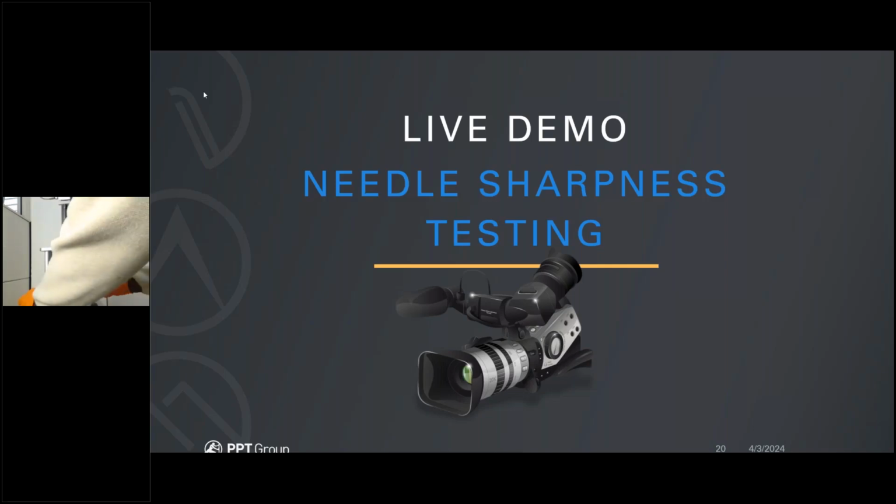So this was the fixturing. We're just using some thumb screws to hold the fixture down. Just going to remove that, set that back here. The second one is a little bit more creative. This base fixture is a multi-purpose base fixture that expands and contracts depending on the sample diameter, sample thickness, sample width, and so on. We want to make sure that the silicone rubber fingers you see on the base are a non-slip material to prevent the samples from lifting or sliding or slipping during the test.